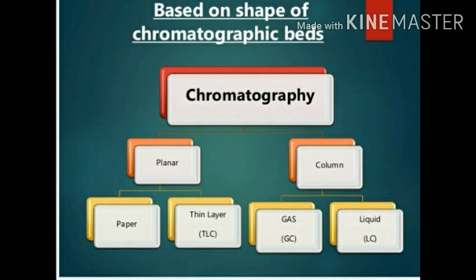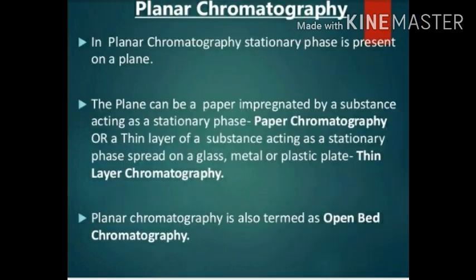Chromatography based on the shape of the chromatographic bed is again divided into planar and column. Planar is again divided into paper and thin layer chromatography. And next, the column. Column is again divided into gas and liquid chromatography. So we have to study more about planar chromatography.